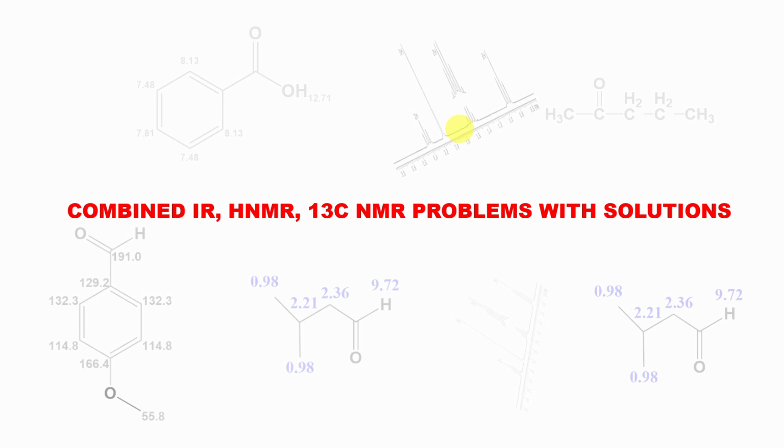In this video tutorial, I will be discussing how to determine the structure of a molecule by knowing the IR values, proton NMR values, and carbon 13 NMR values, or combined IR, proton NMR, carbon 13 NMR problems with their solution. Let us discuss the problems one by one.